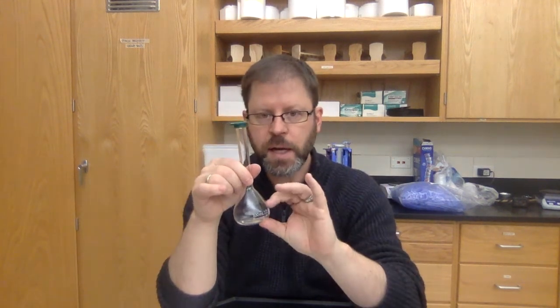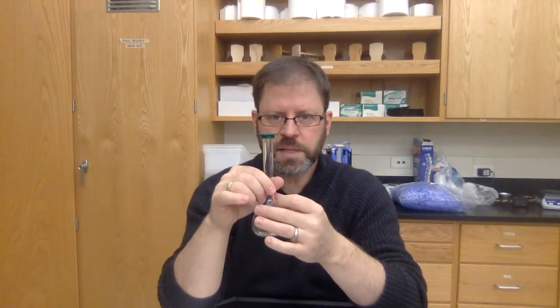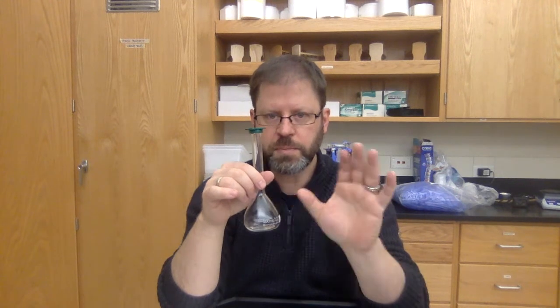The tablet in its powder form, that binder is not going to dissolve. And so you're going to see some, I think it's a little bit yellow from the vitamin C actually dissolving, but then there's going to be some floaties up here as well that's part of the binder. And there's just nothing you can do about that. That's not vitamin C that's sitting there, that's the binder. So the vitamin C is very soluble. So it is in solution.